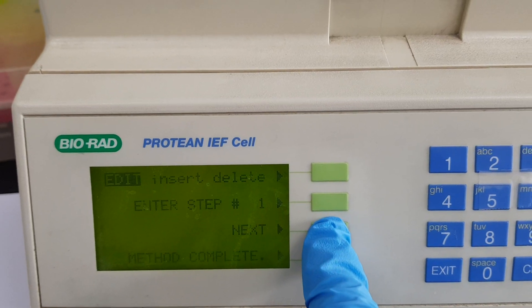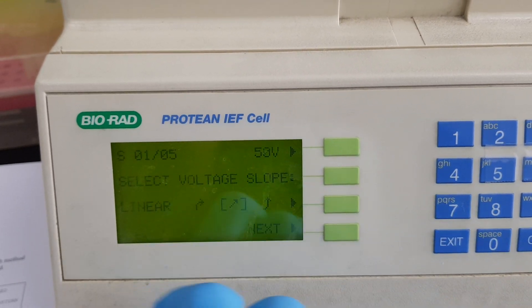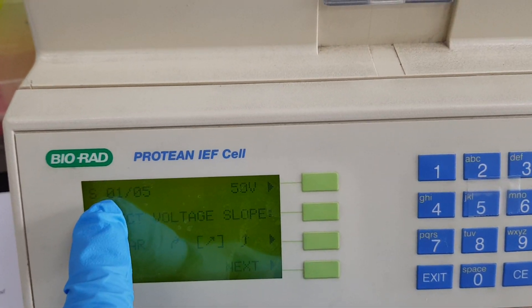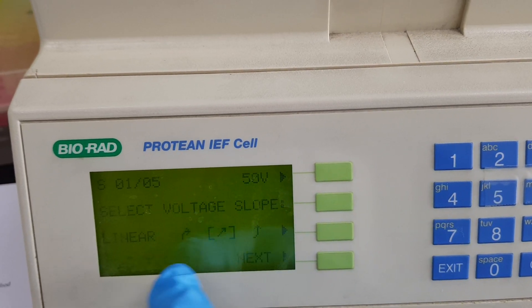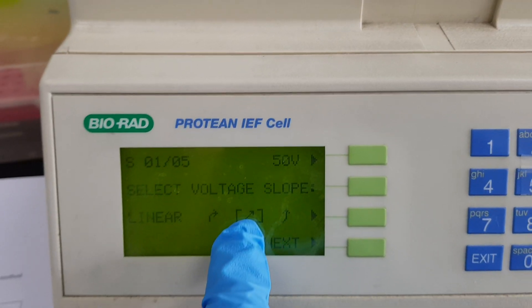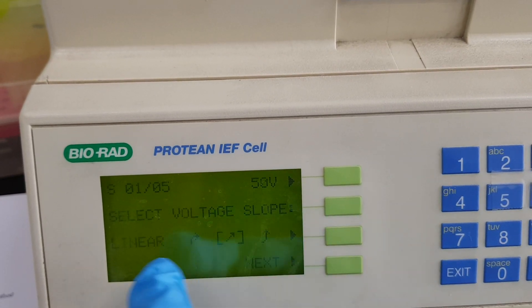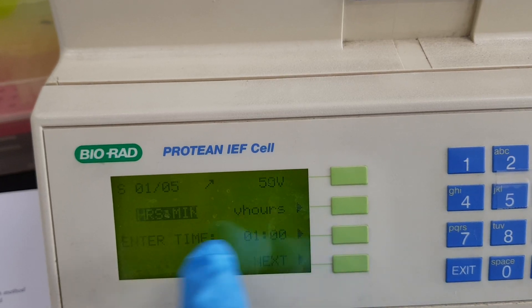Step number one is selected. My step one out of five is 50 volt, and it is already selected here. We then need to select the voltage structure — I select linear here. So step one is set with 50 volt linear voltage and we will go for the next one.